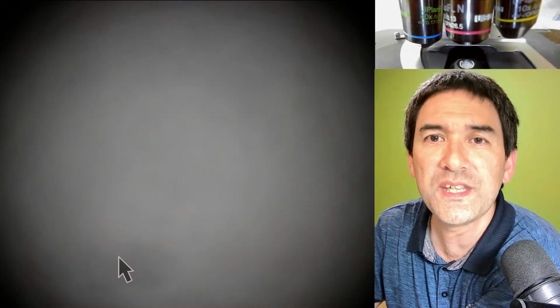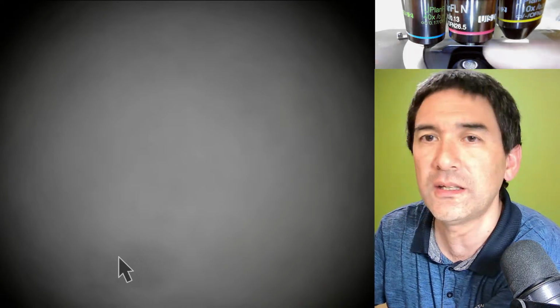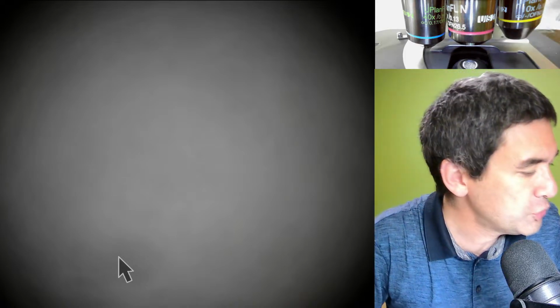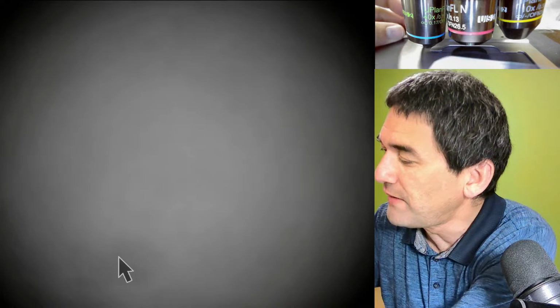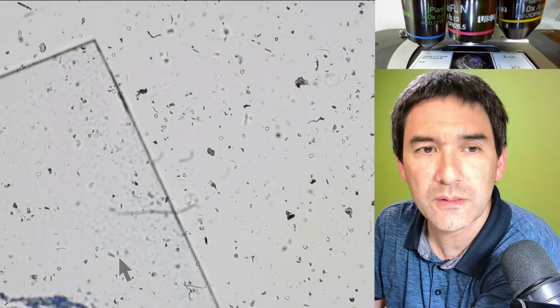What you see up here at the top is basically the objective. It's a 4 times objective, and I'm just going to show you the slide again with the artery and the vein.